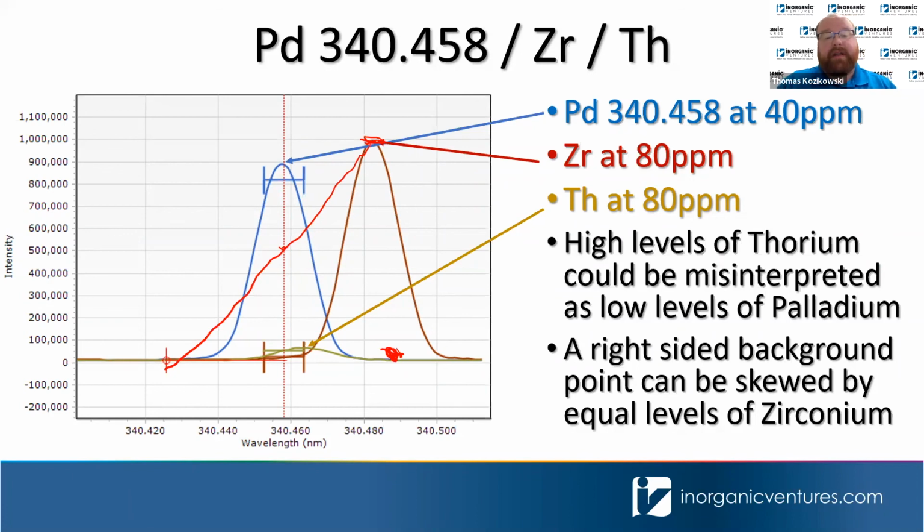And with the thorium, I wanted to mention that if you have high levels of thorium and you tried to use this line for palladium, you might misinterpret low levels of palladium, even though it's really high levels of thorium.